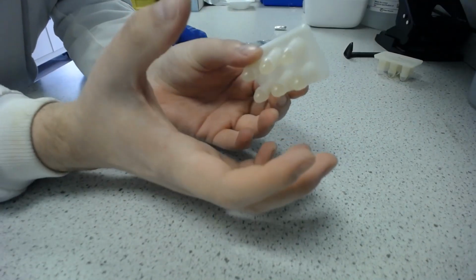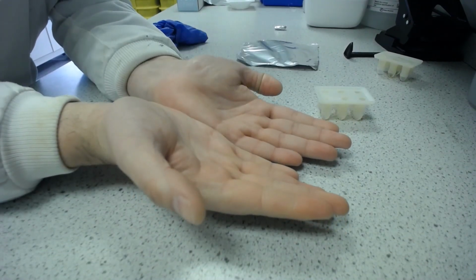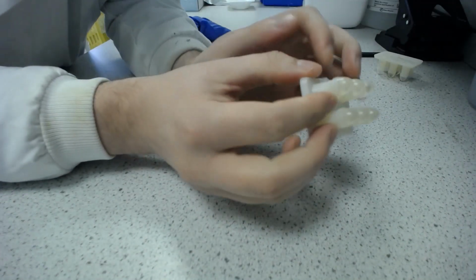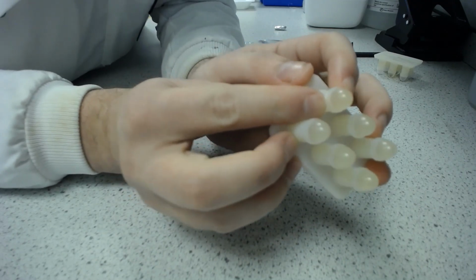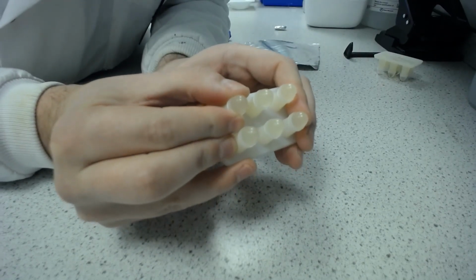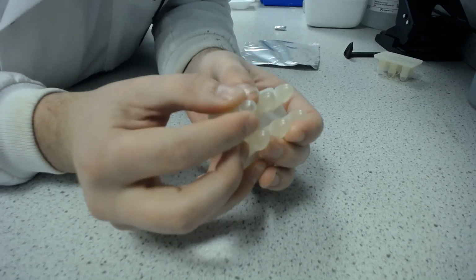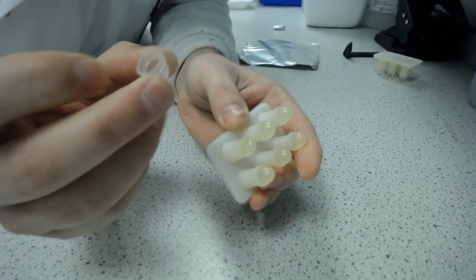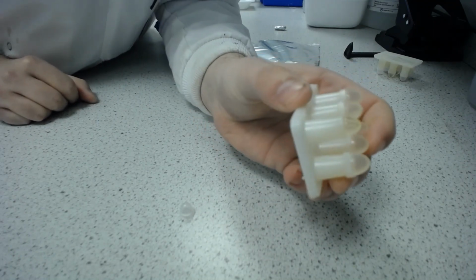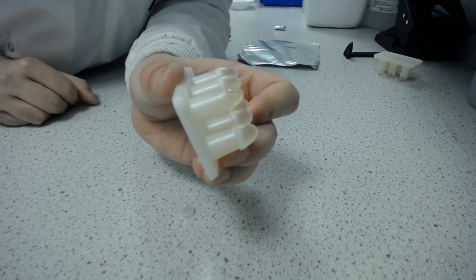Now we need to get them out. Now the old style moulds, you'd have two halves and you'd break open the mould and you'd have the suppositories there. I think they're better for doing suppositories, but we're using these ones. So first of all, you need to take the tip off of each individual mould. So we do that, we'll give it a little twist, just a little twist, and then very gently ease off the mould tip. Keep that safely to one side, put it in the camera view, and then we can see that we have an exposed suppository tip there. There we go.